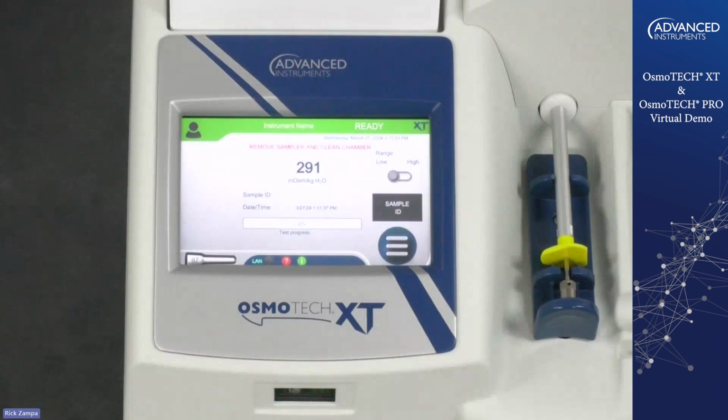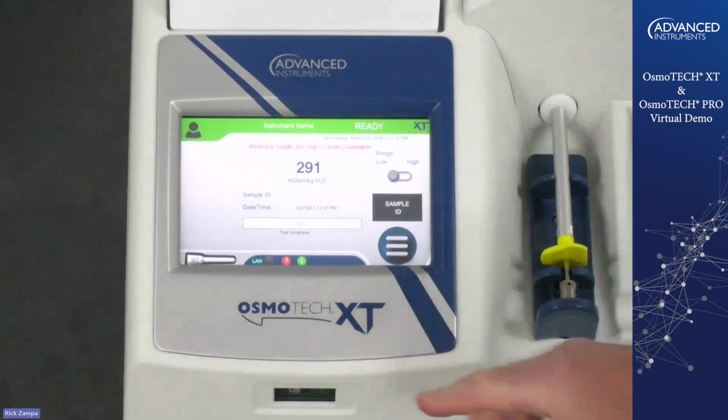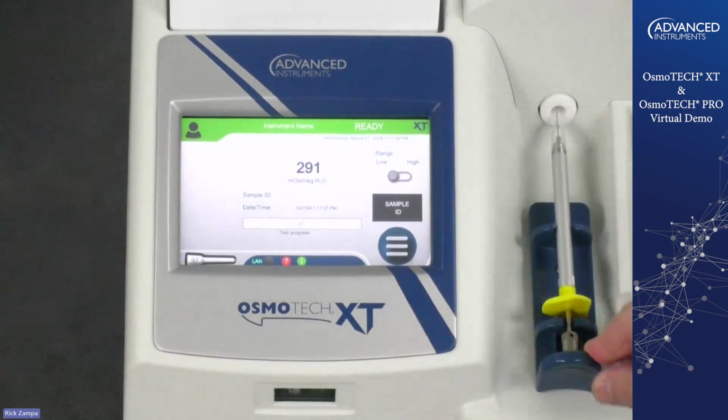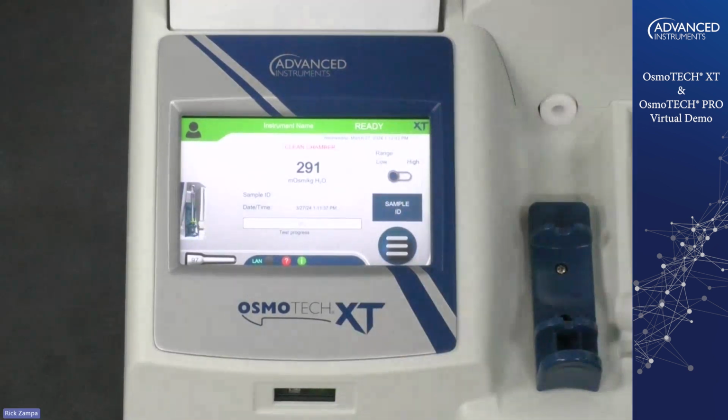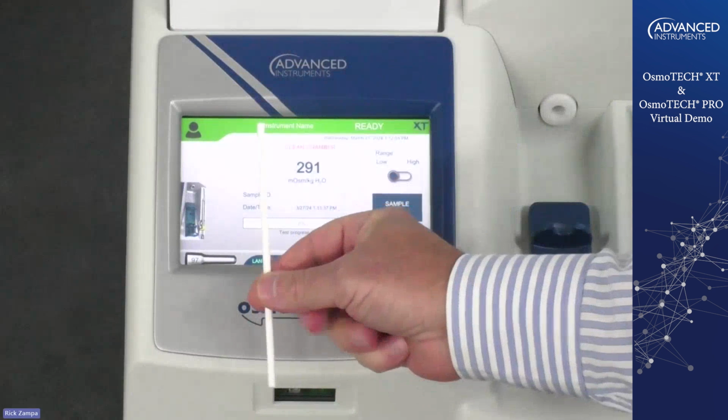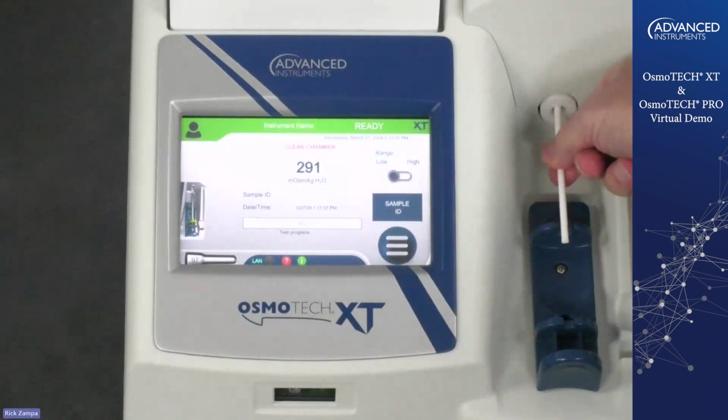It says remove sampler and clean chamber. So what I want to do now is slide the sampler out. So I've removed the sampler here. I'm going to grab one of our cleaners and insert it into the instrument.